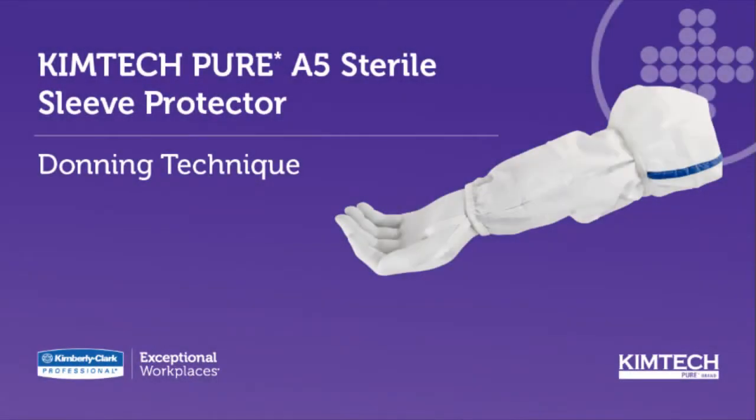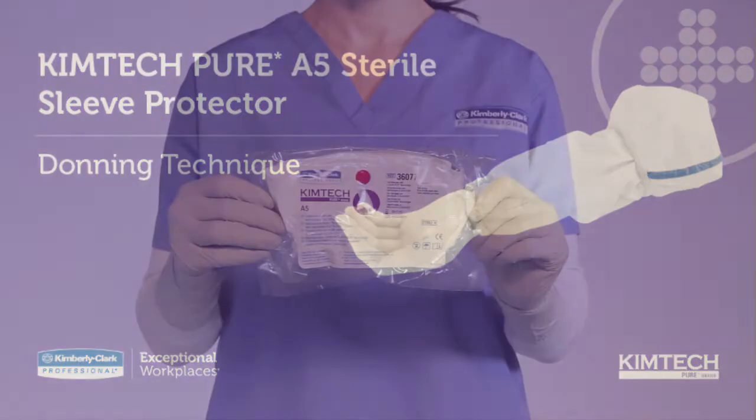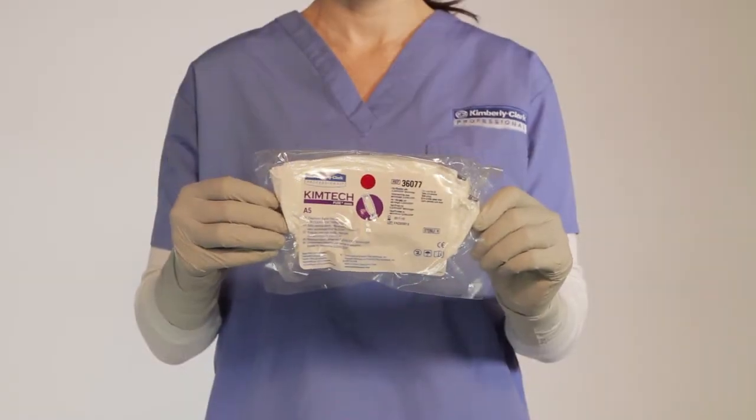This video demonstrates the donning technique for the Kim Tech Pure A5 sterile sleeve. First, select your sterile sleeve.